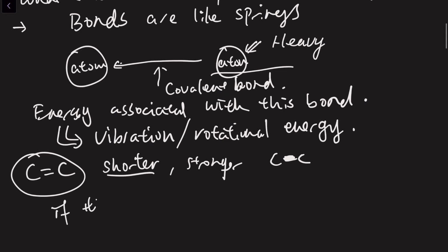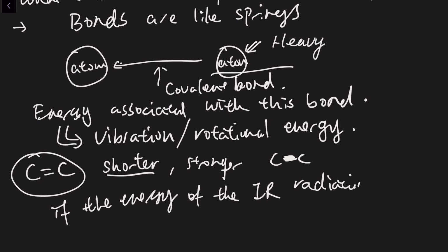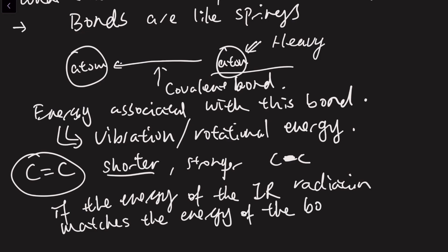So if the energy of the infrared radiation matches the energy of the bond, then you will get something called resonance.